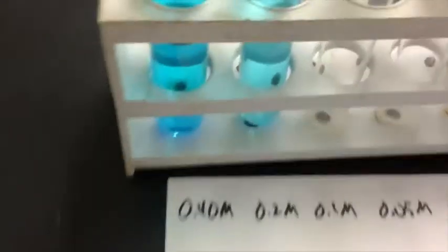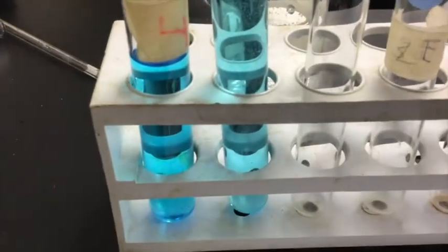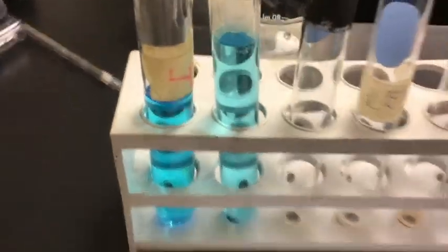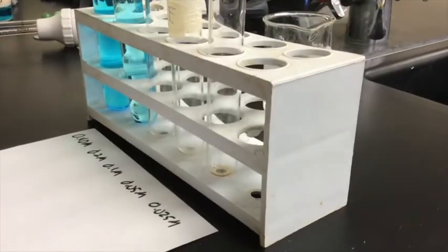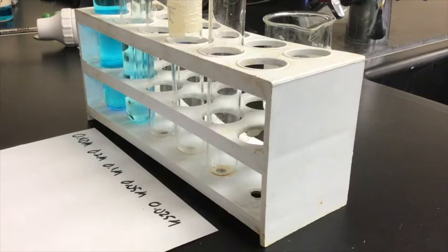So you can actually tell right off the bat, that's a little bit easier in person than perhaps it is on camera. But the one on the right is lighter than the one on the left because, again, we have cut the concentration of it in half. So now I'm going to do the next part of my serial dilution, which is to take 10 milliliters of this, which is now 0.2 molarity, right? So that's 0.2 molarity, and put it into the next one.